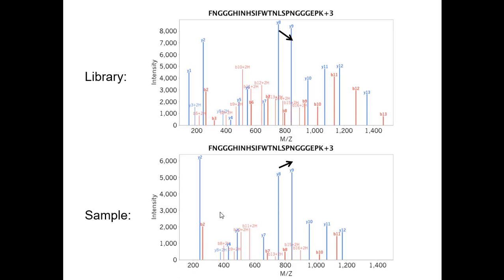Yeah? Could this be related to the charge collision energy issue you mentioned? Yeah, definitely could be. Here, this is a +3 peptide, so it's fragmented with the wrong fragmentation patterns, or the wrong charge state assumption, basically. That's definitely one potential concern. What are other ways that you could actually get peaks that are out of place?